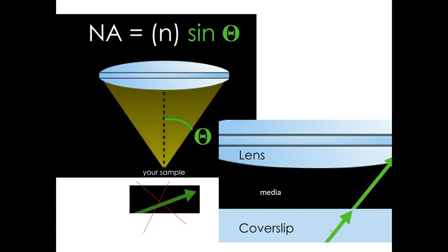See, the light is refracting when it comes to the cover slip and then it is going this way. Okay, this is the refractive index of the media between your lens and the specimen. And this is the media or the vacuum. Now, we all agree that the lens is not going to be able to collect the 90-degree angle of light coming from your specimen. Okay. So the sine of 90 degrees is 1. We take the sine of 90 degrees as 1.